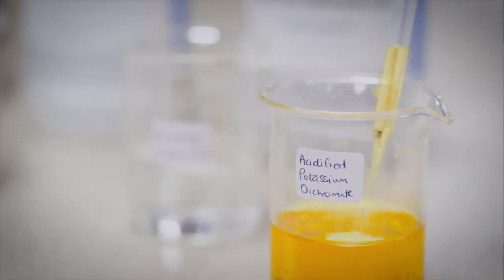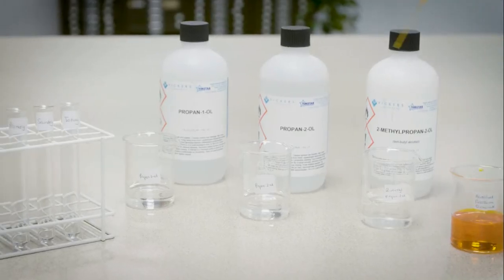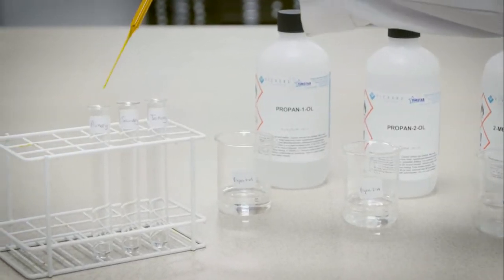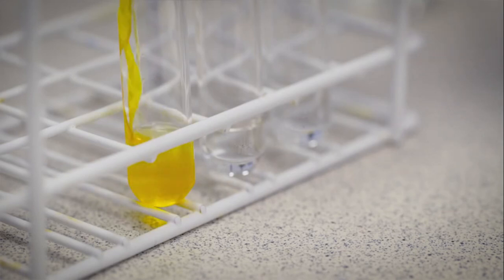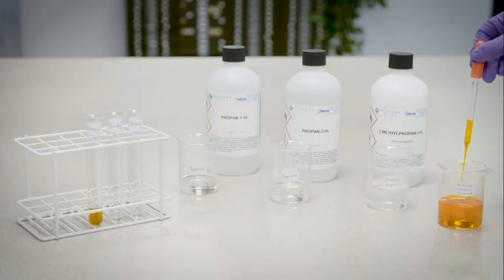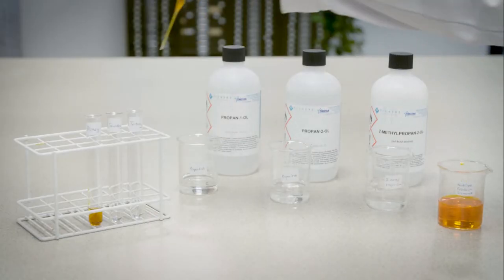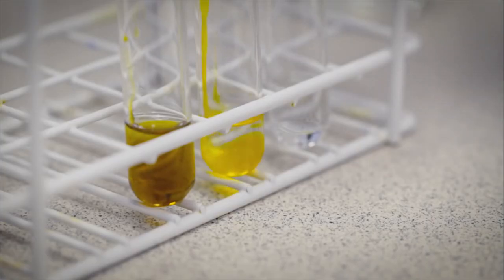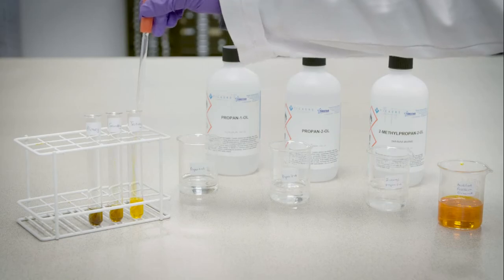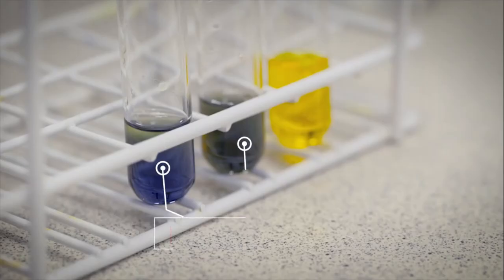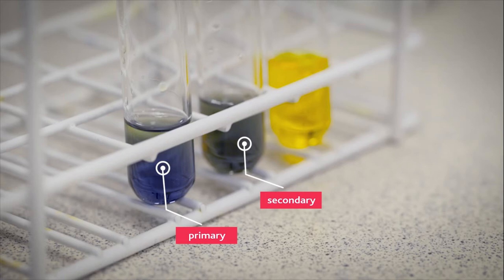Acidified potassium dichromate solution is then added to each test tube. After a few minutes, the test tubes containing the primary and secondary alcohols have turned green-blue. The test tube containing the tertiary alcohol is unchanged.